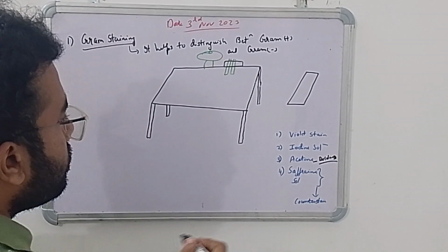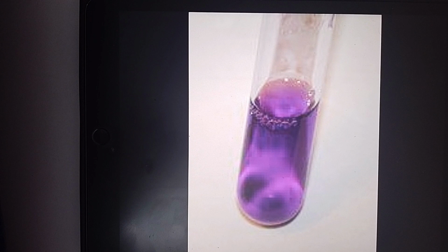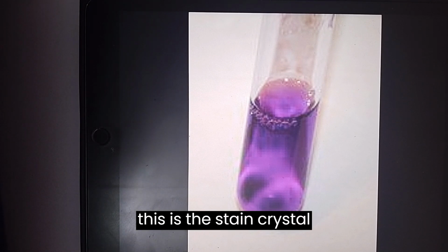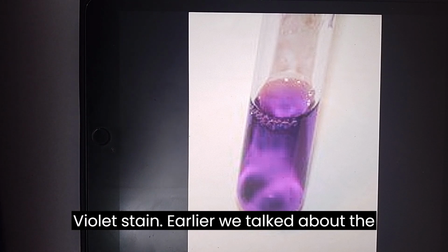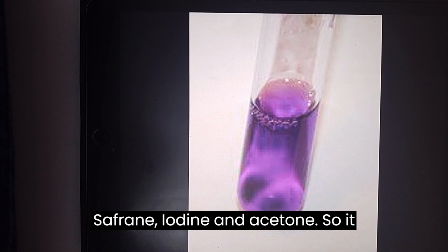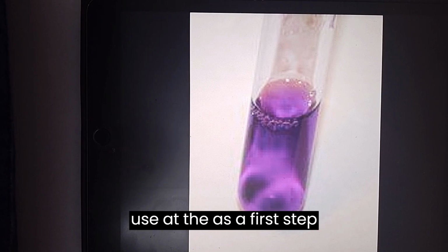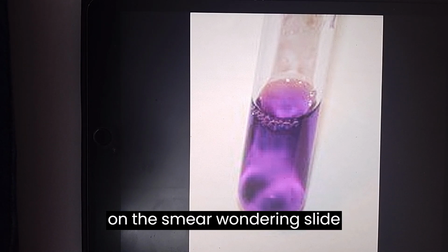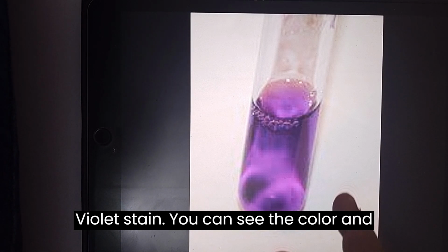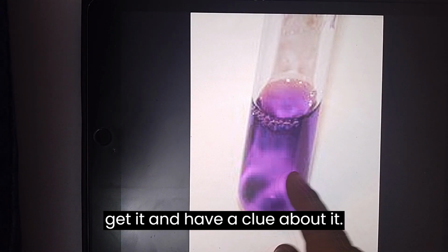So we will perform this activity with the help of these four agents. This is the crystal violet stain. Earlier we talked about the stains. There are four stains: crystal violet, safranin, iodine and acetone. Crystal violet is one of the main stains we are going to use as a first step on the slide containing a smear. You can see the color and the depiction in the image, and get a clue about it.